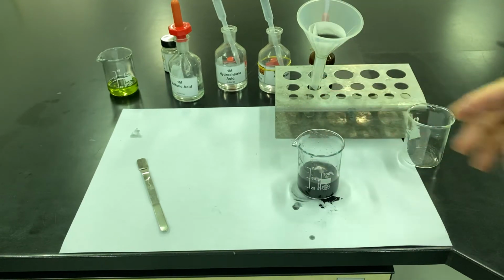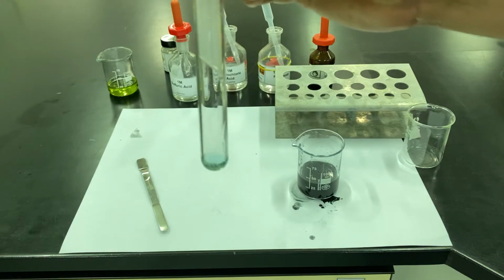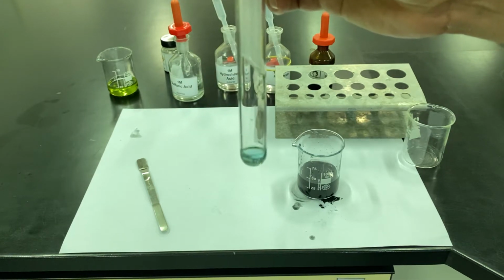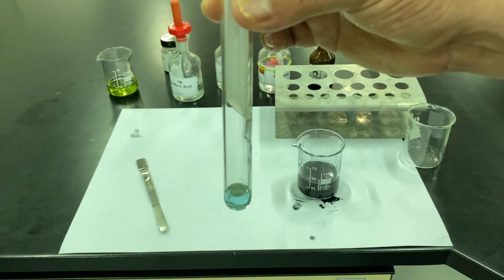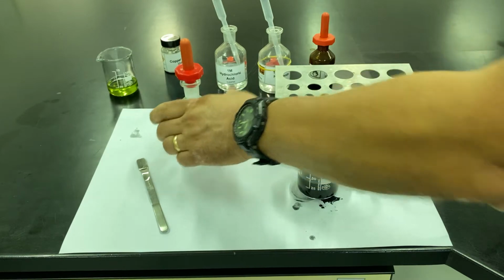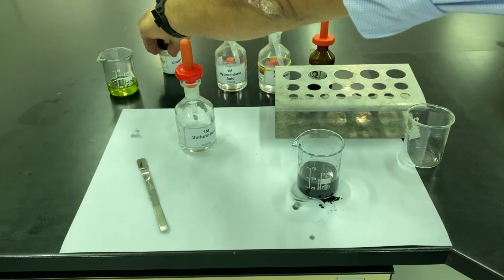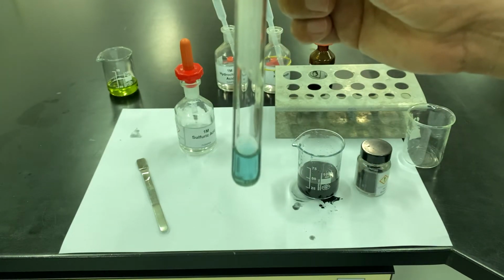What colour is the solution that's being produced here? Well, hopefully you can see there that it's a blue solution. So we started with the colourless sulfuric acid. We had the black powder, which is copper oxide. But one of our products is a blue solution.